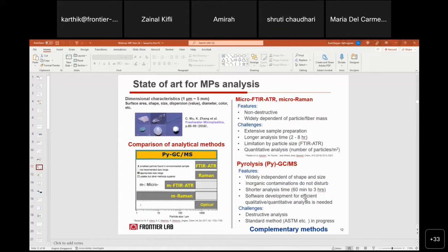Okay, now we come to the main part of this webinar, the analysis. How is microplastic analysis being done in today's world? Definitely spectroscopic techniques are widely used, starting from optical microscope, then people have moved to FTIR, ATR, then Raman, then micro FTIR, then micro Raman. Each of these techniques has its own advantages and limitations.